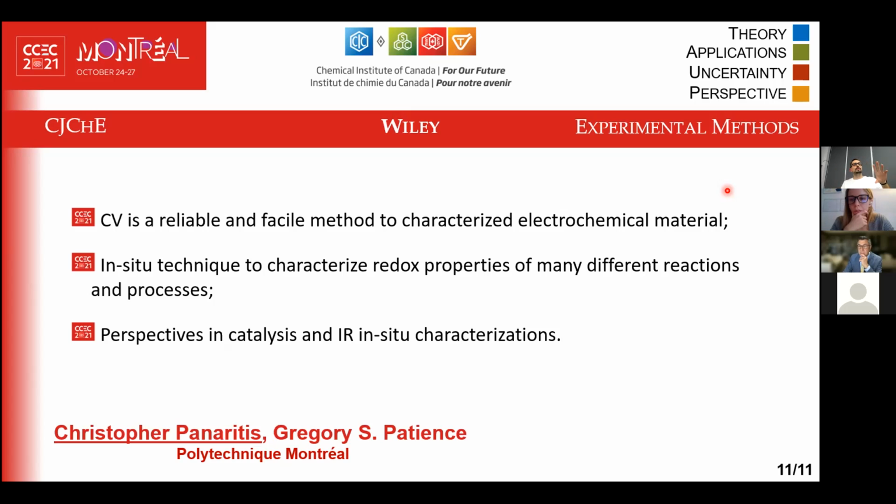So that's what the catalysis is. When we do the glycerol oxidation, the catalyst is deposited on, and so you're able to actually determine everything. As long as they don't overlap, you can see the oxidation state of the catalyst and also the solution change as well. Again, you have to do everything separately to really reference what process is occurring.